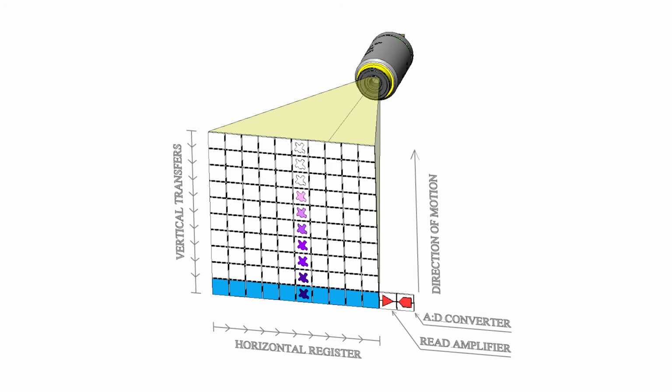image. Each of the squares in the diagram represents a single CCD sensor pixel. For purposes of illustration, we have only drawn 100 pixels in a 10 by 10 array. An actual CCD sensor has millions of pixels. Each pixel accumulates light, which it converts into electrons.